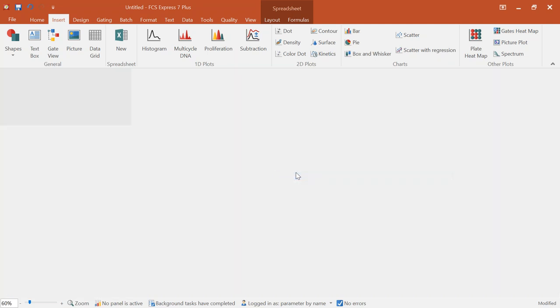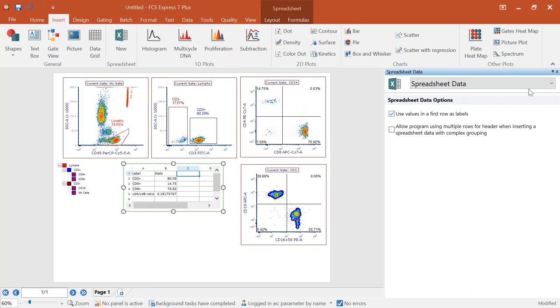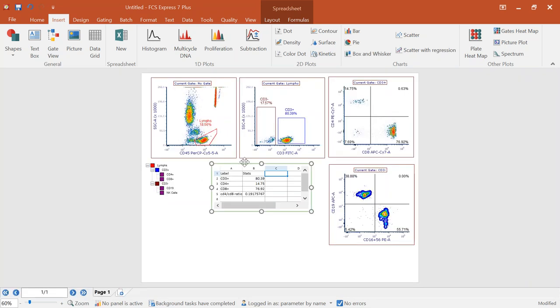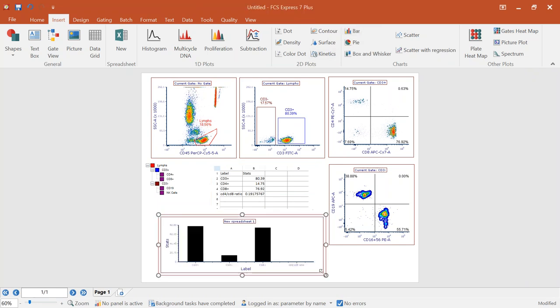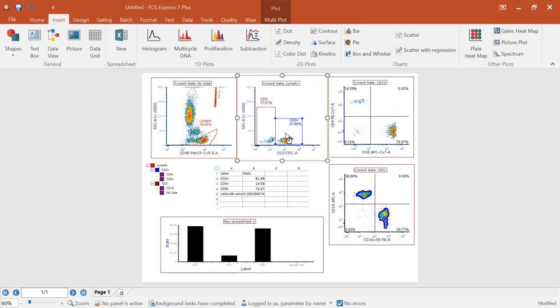Additionally, we have other plot types that will help you get to your final result. I'll insert a bar plot — you can also choose pie charts, box and whiskers, scatter with regression. I've got my bar plot for my different statistics, and as I move my gates around, everything in the bar plot updates as well. This is a final result: getting a spreadsheet, getting a bar chart, getting information from all your data — that's what we're trying to get you to in FCS Express.